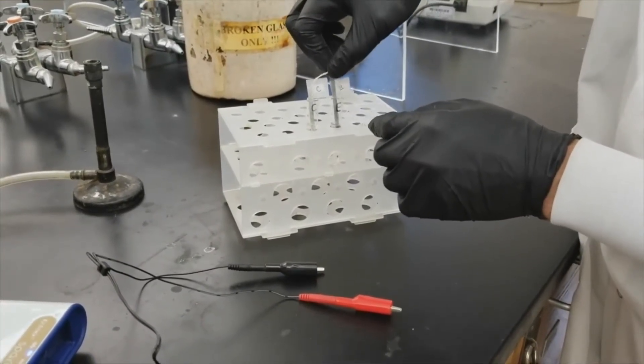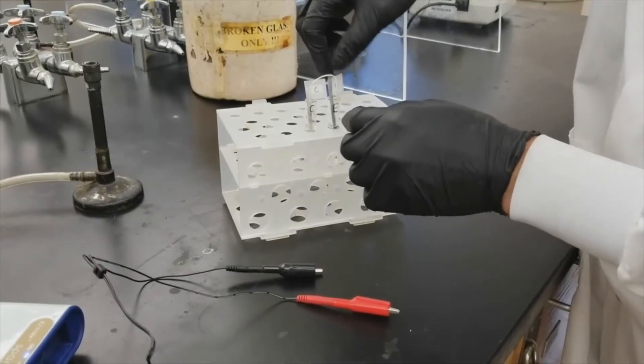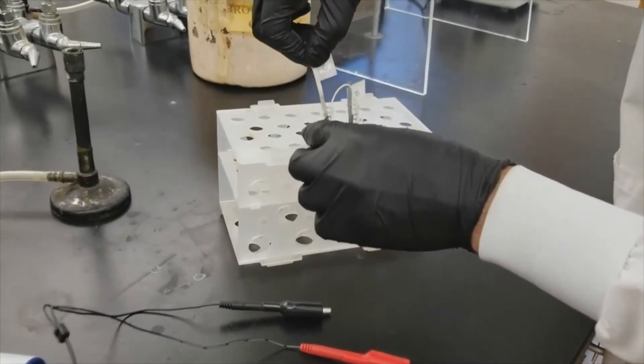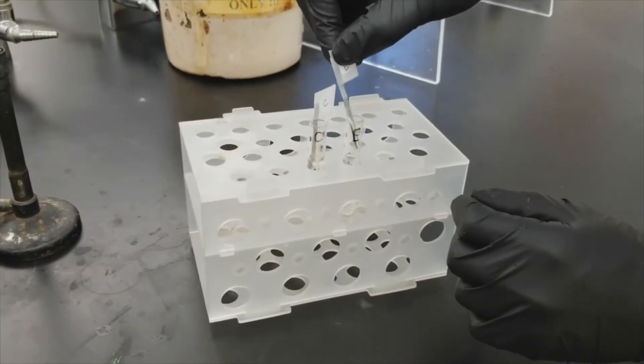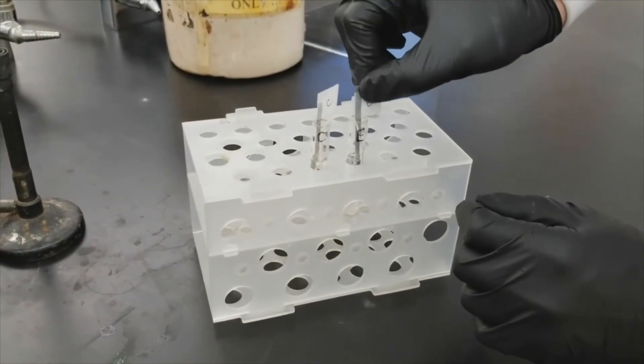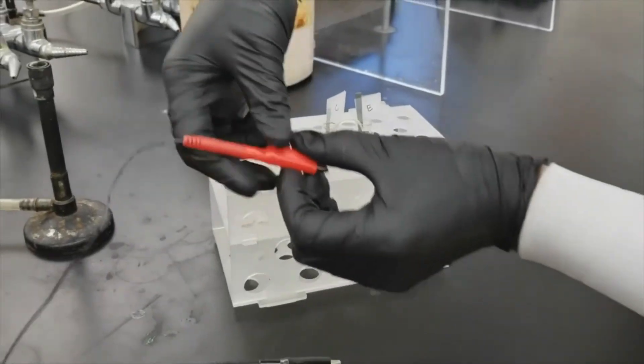You'll create your salt bridge by soaking a piece of string in potassium nitrate. Then place the string into the two test tubes so that each end of the string is submerged in the metal ion solutions. Make sure the string is pulled tight between the test tubes so it shouldn't dip down in between.